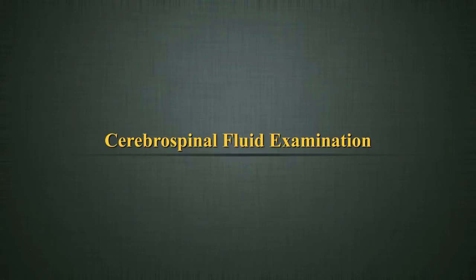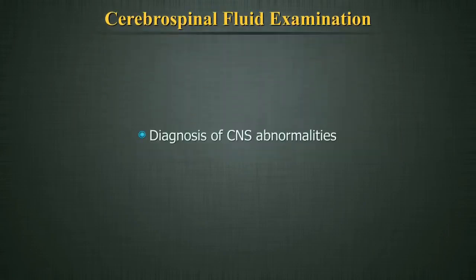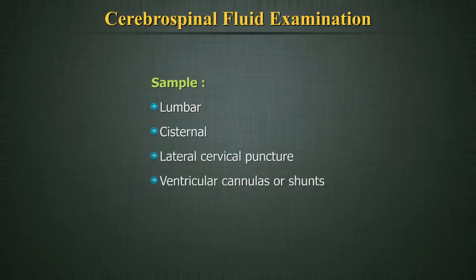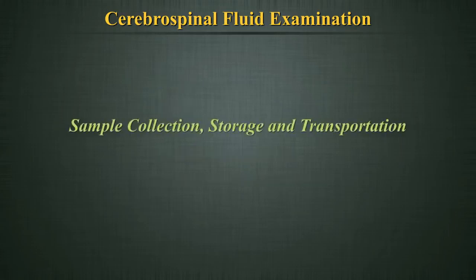Cerebrospinal fluid examination is done for diagnosis of central nervous system abnormalities. Samples are obtained by lumbar, cisternal, or lateral cervical puncture or through ventricular cannulas or shunts. Sample collection, storage, and transportation.